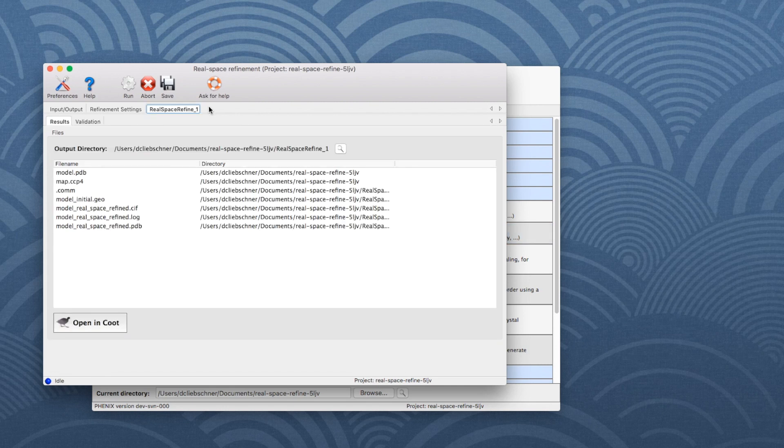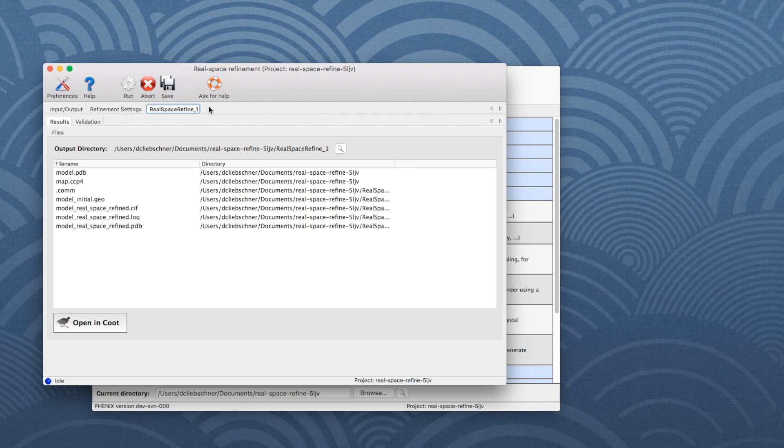When refinement is finished, two new tabs, called Results and Validation, appear.